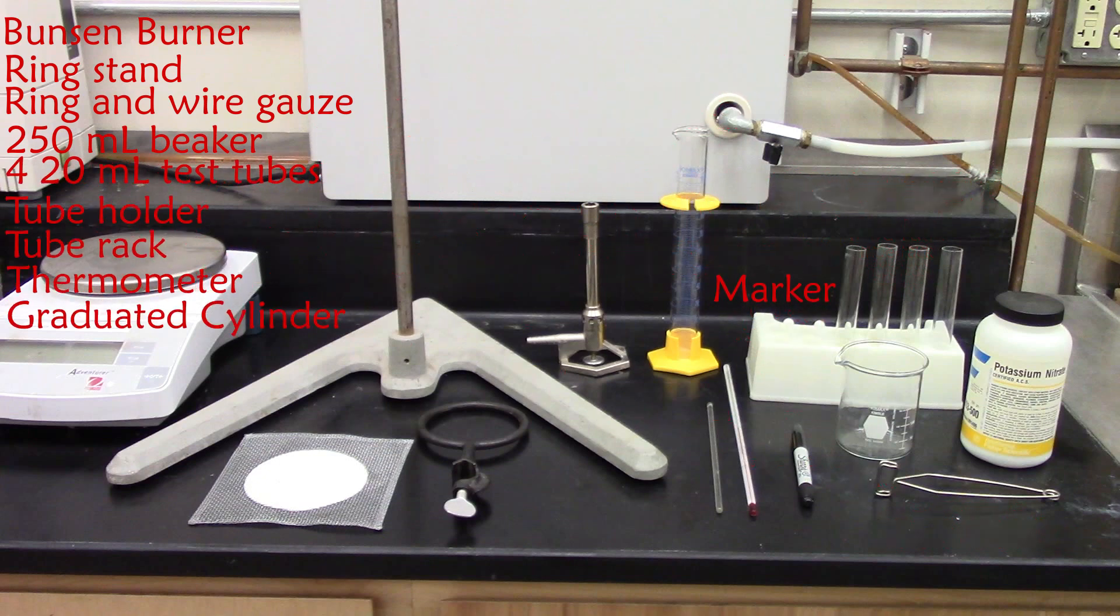You will also need a glass stirring rod and a weighing scale. For reagent, you will need 20 grams of potassium nitrate.